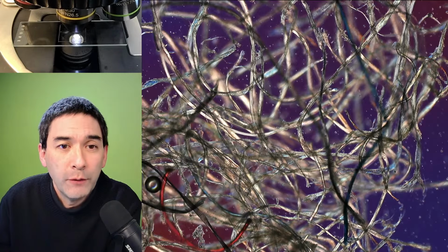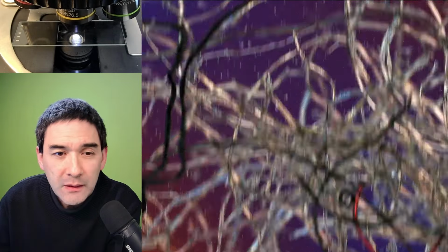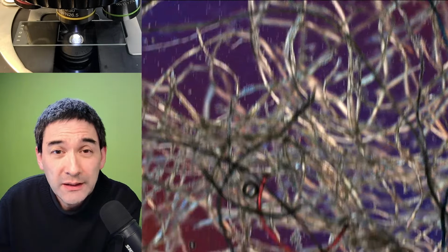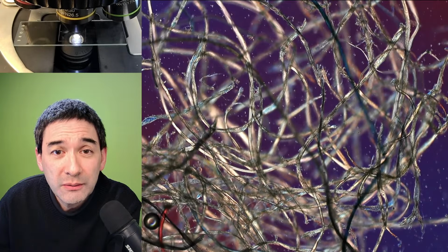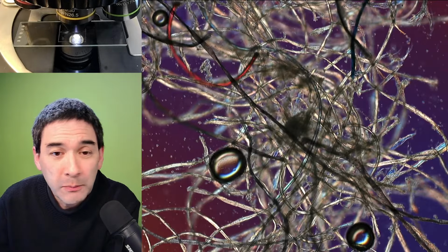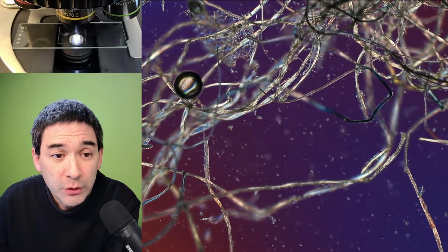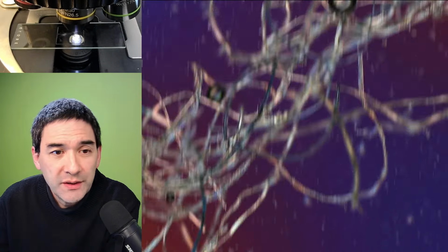Basically they come off from the clothing, and this already shows something quite interesting: if there are synthetic fibers in clothing, nylon, polyester, and so on, then this indeed contributes quite a bit to microplastic pollution as well. Natural fibers, like cellulose fibers, cotton for example, are not a big problem. But there are also synthetic fibers around that can cause problems, especially when they're taken up by organisms.